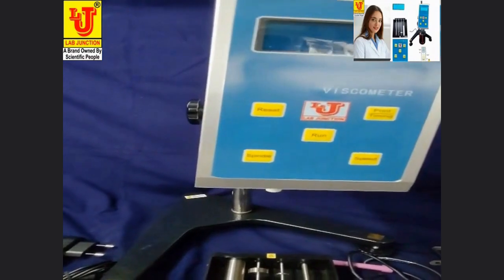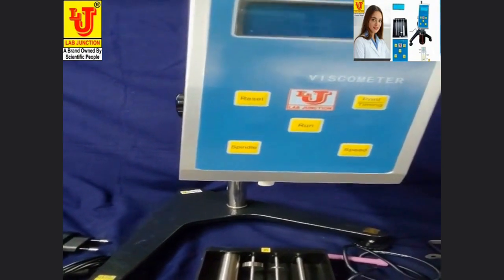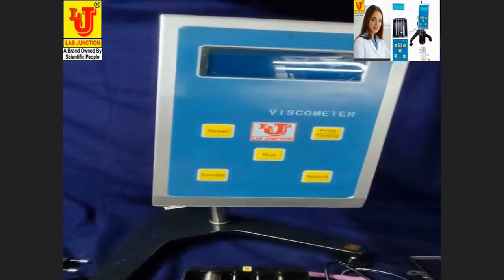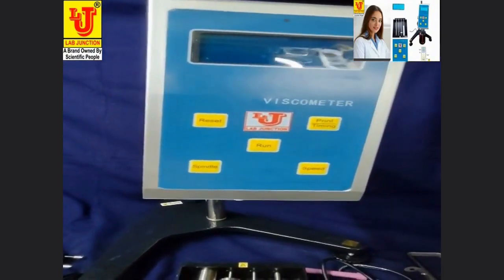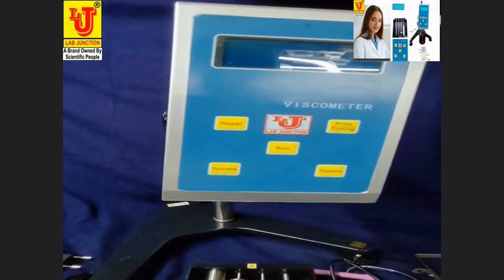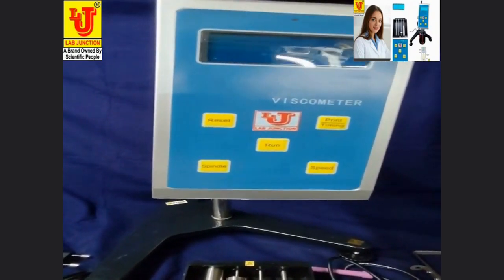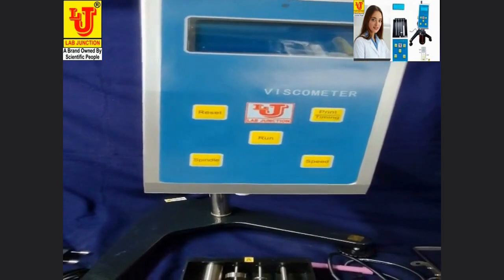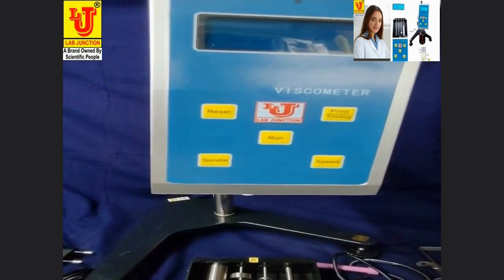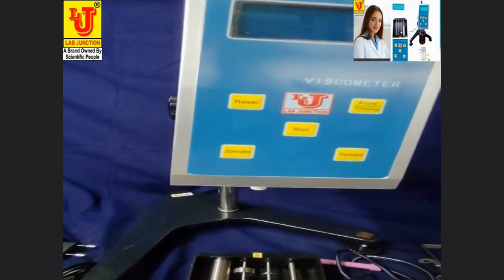Viscosity meters are used in checking the viscous resistance and dynamical viscosity of liquid. They are widely used in measuring the viscosity of various liquids such as grease, painting, foodstuff, dope, paper making, cosmetics, chemical industry, capsule, stickiness agent, and medicines.